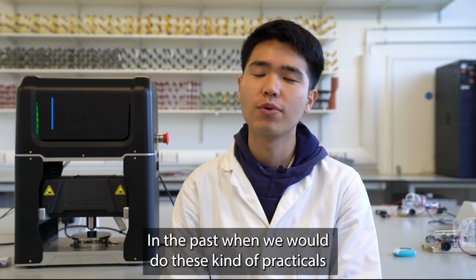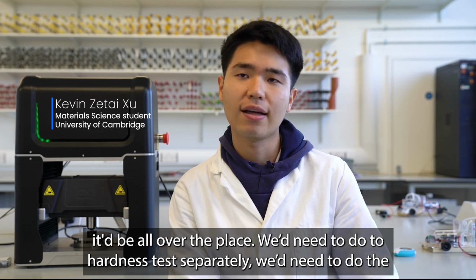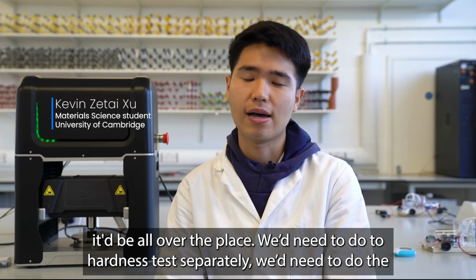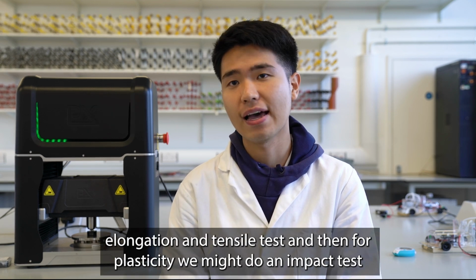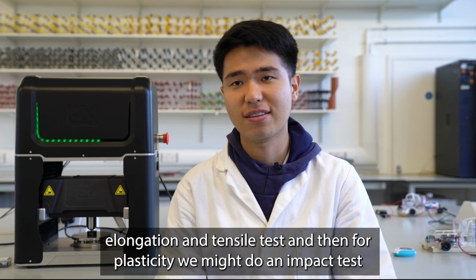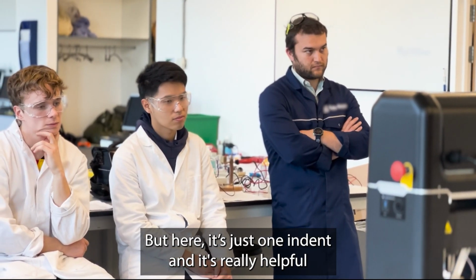In the past, where we did this kind of practicals, it's all over the place. We need to do the hardness test separately. We need to do the elongation, the tensile test, and then for plasticity, we might do the impact test. But here, it's just one indent.